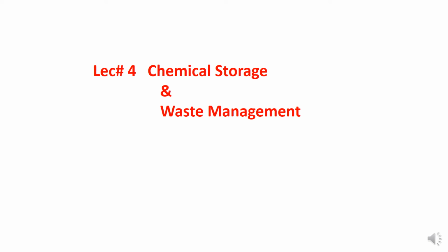Good morning, students. Today we will discuss chemical storage and waste management. These two topics are very important with respect to the lab safety course. We will not go into detail about chemical properties, but we will cover the basic things about chemical storage and waste management.